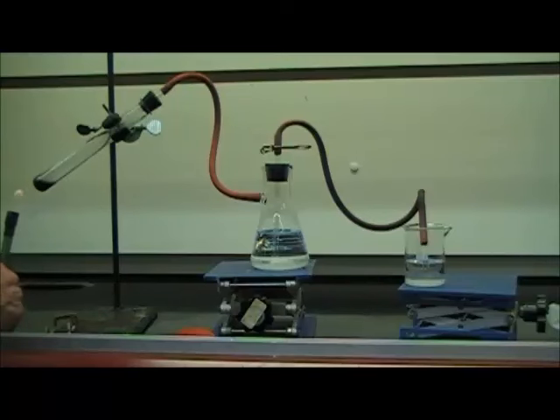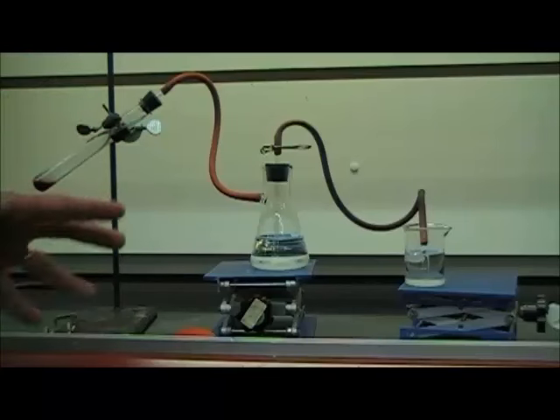Okay, it's going pretty fast now, so I'm going to stop. I'm just going to let it stay as is, not going to touch it at all. I'm going to go ahead and turn off the Bunsen burner because we're done with it at that point. And now what we do is we just wait.